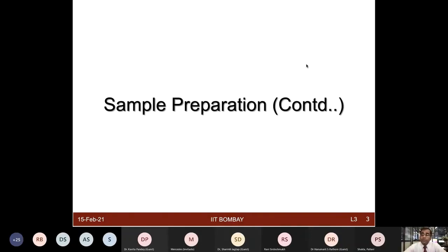If you think about proteomics, we have to see what is the maximum protein we can obtain from our sample. That is one of the key goals, because only then are you doing proteome-wide scale analysis. One method cannot be 100% sufficient to give you a glimpse of the entire proteome. What we are talking about right now is global protein analysis. Think about possibilities where you are looking at only phosphoproteome analysis or any type of specific post-translational modification.